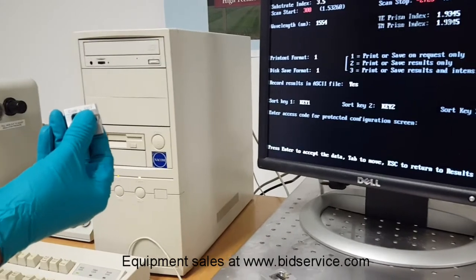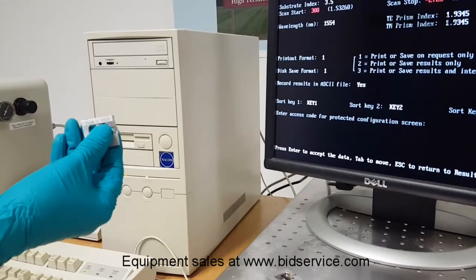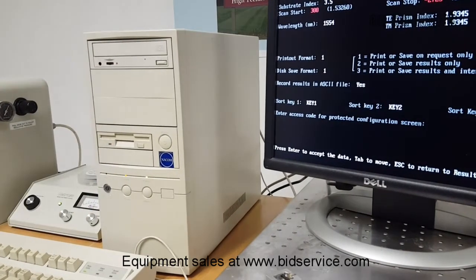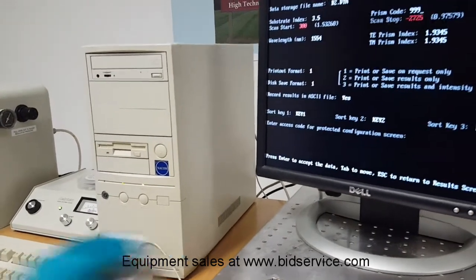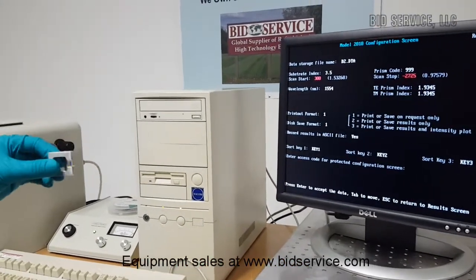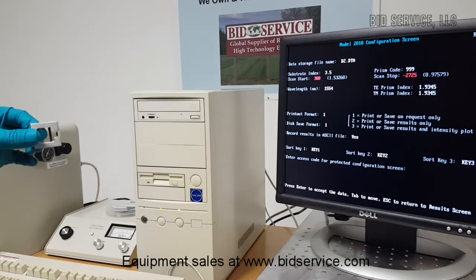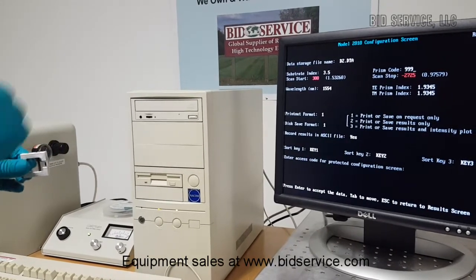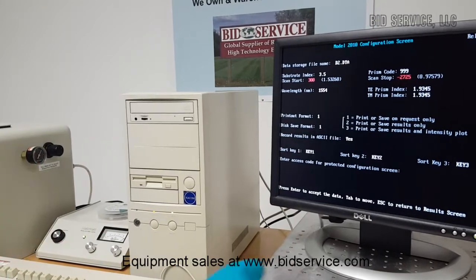These numbers are very critical for the measurements. For accurate measurements, the code should be entered correctly. Basically the Prism is to be mounted vertically like this, and a thumb screw will secure it in its position.